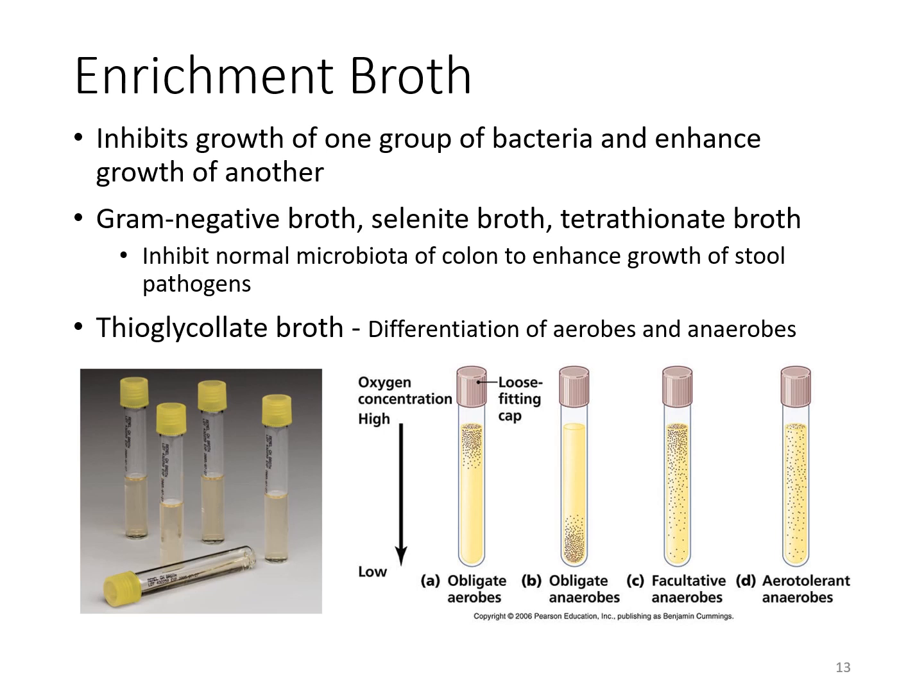So these broths are just liquid media that's in a tube of some sort. When you put the specimen in there and it grows, it will give you a picture of where that organism will grow. So where you see that cloudiness and that thickness to that organism will indicate exactly how aerotolerant it is. You know, is it an anaerobe or is it an aerobe? So you'd put that cap on loosely, and then the oxygen would seep into it.